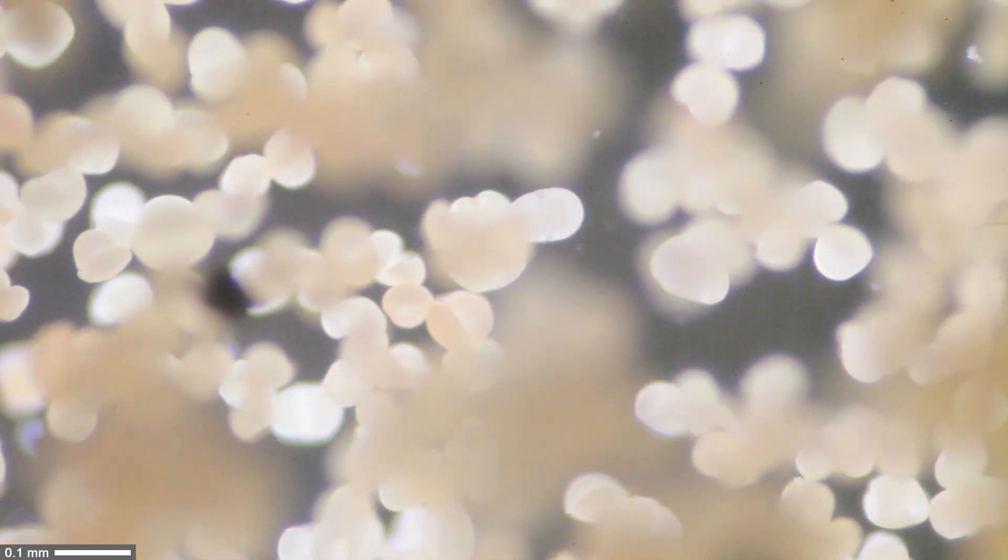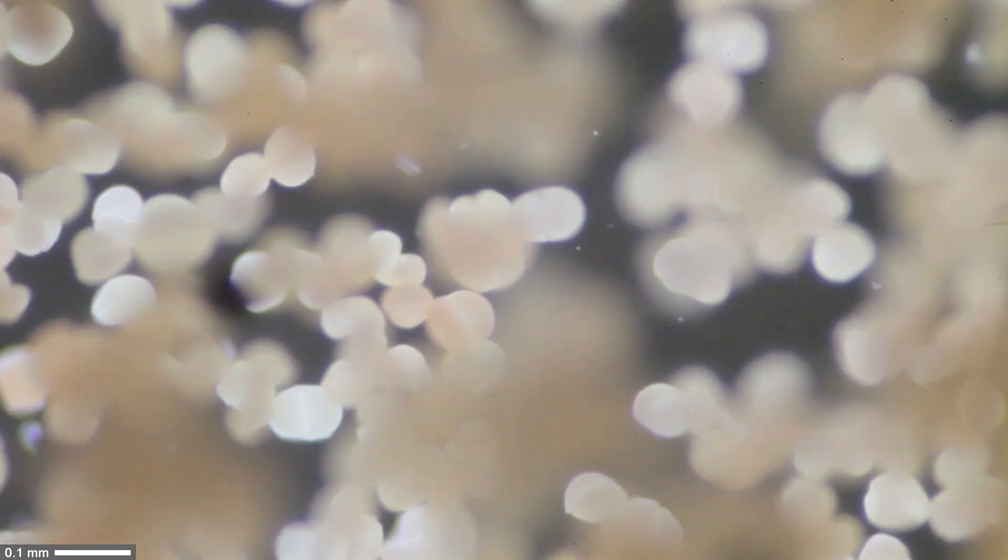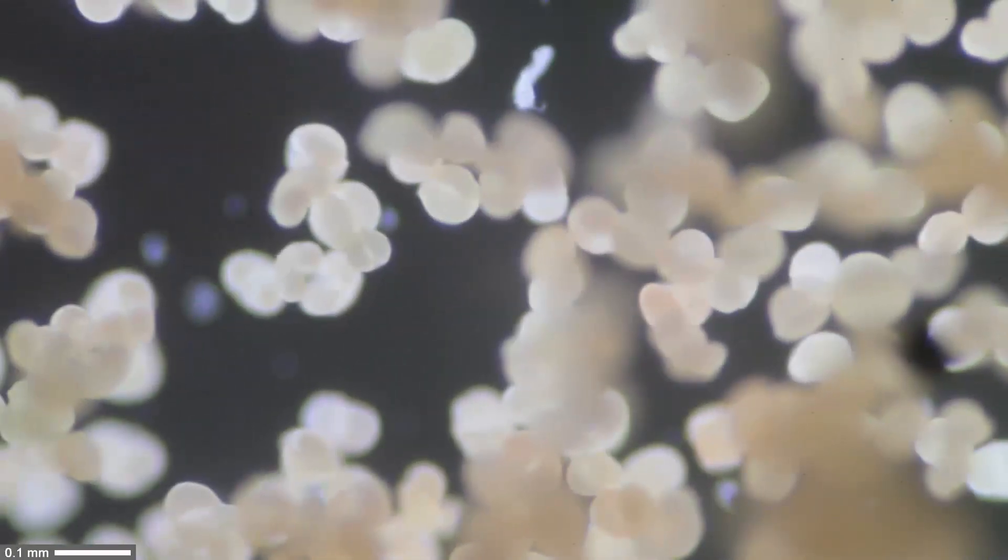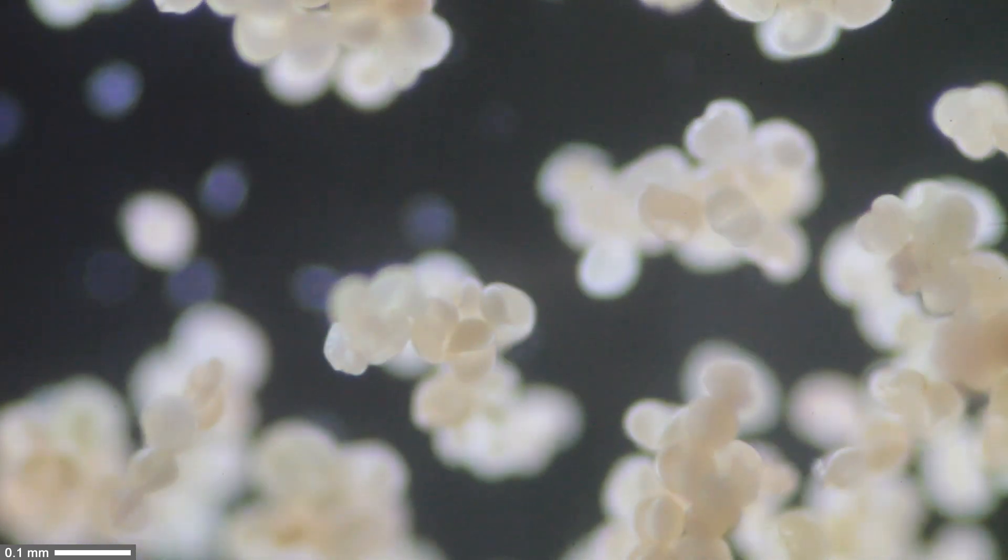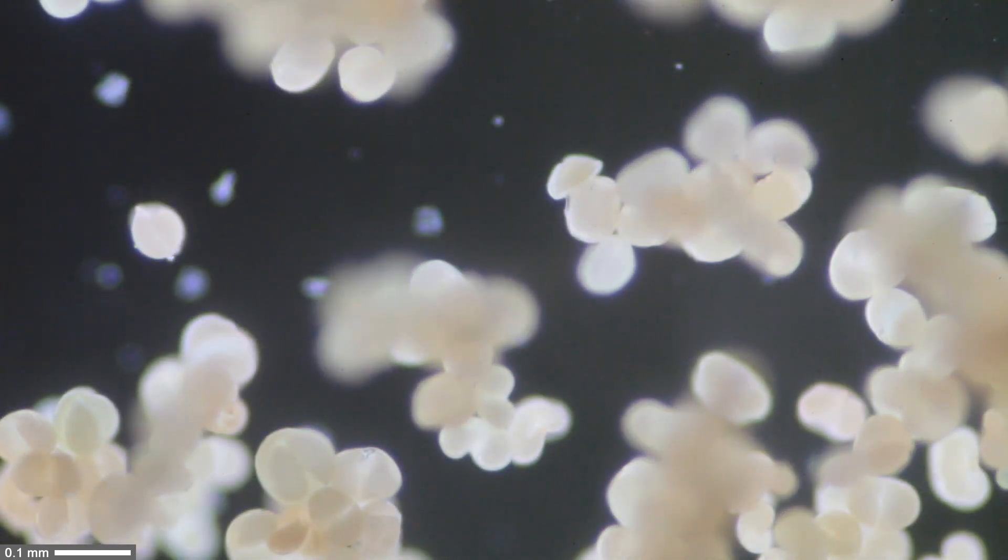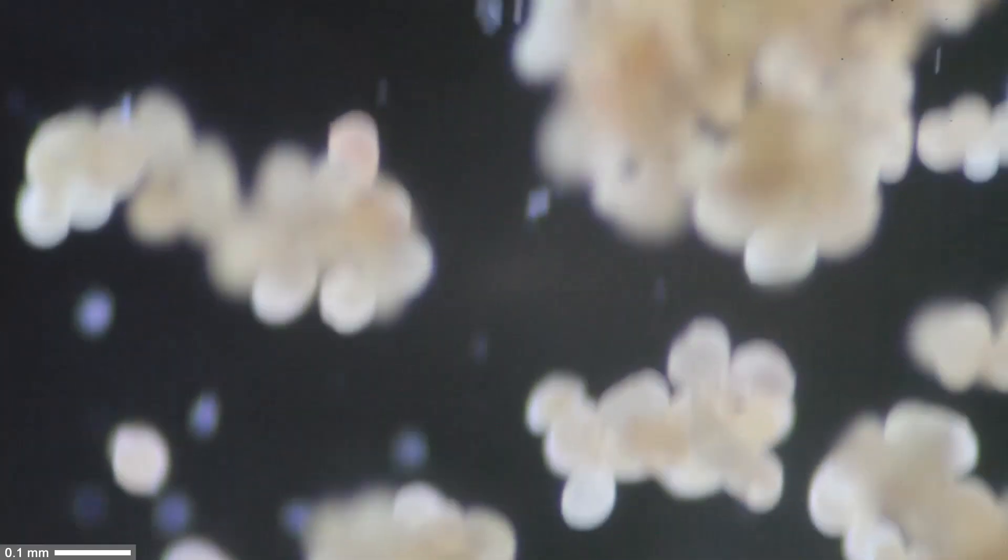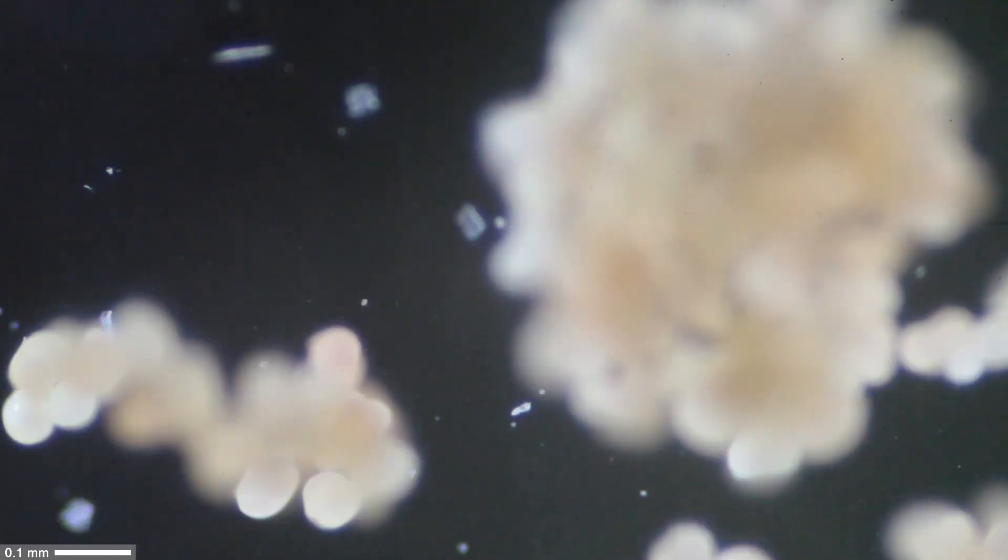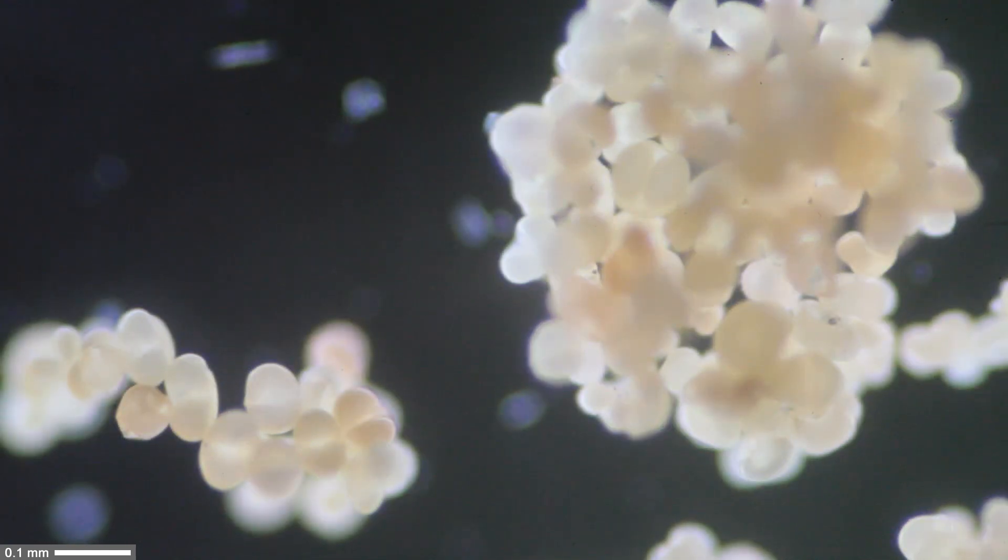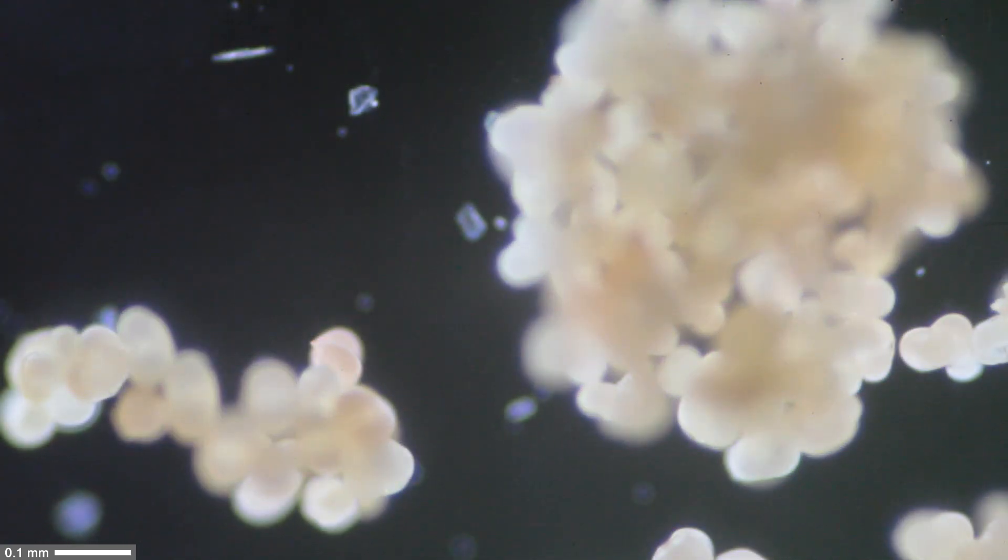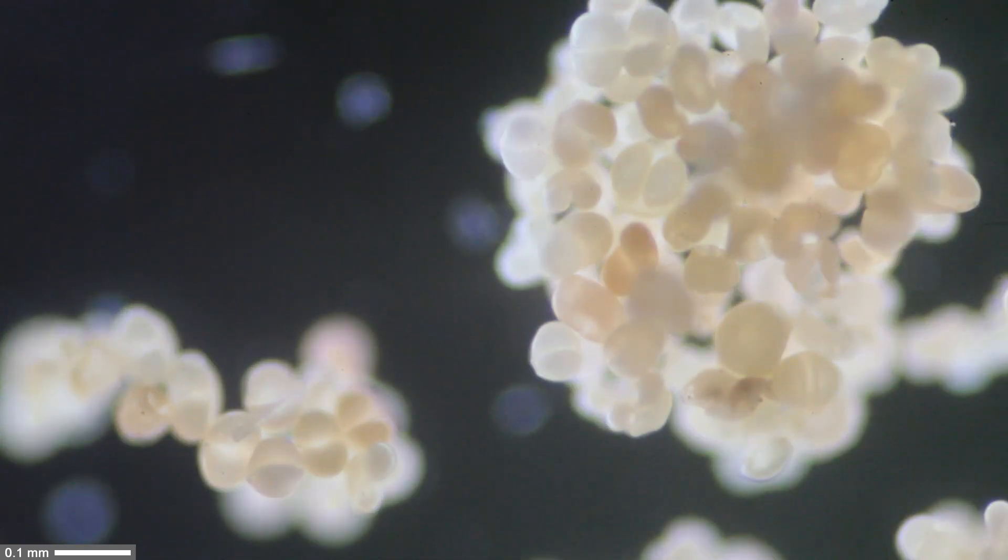The pollen have a yellowish color. When you open the diaphragm, it's more blurred with overexposed highlights because the camera does exposure adjustment and gets confused if the background is too dark. I'm using the fine focus to focus through the different layers.